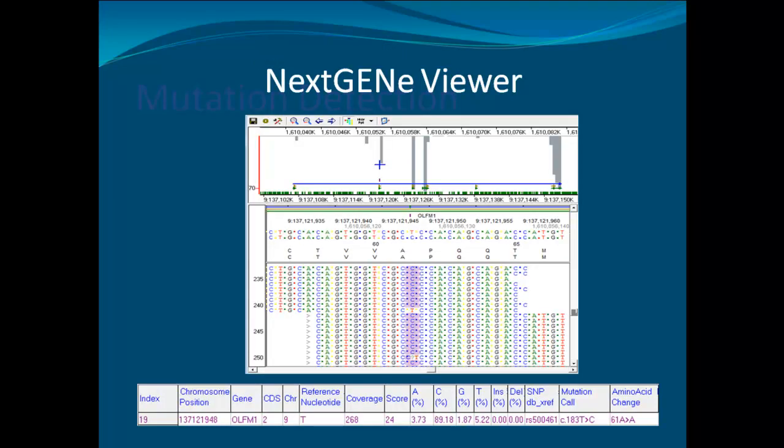In NextGene Viewer, all detected mutations are highlighted and listed in the mutation report. Purple is used for reported mutations and blue is used for novel mutations. The mutation report includes detailed information for each mutation, including annotation information like gene name, CDS number, chromosome name, and chromosome position. Statistics like coverage, nucleotide frequency, and the mutation confidence score are also shown. The report is highly flexible and can be filtered to show only coding sequence mutations, high reported mutations, high synonymous mutations, or filter out mutations with low confidence scores.